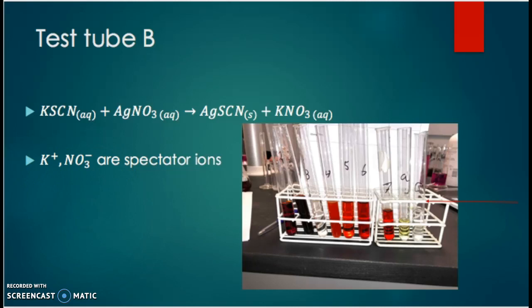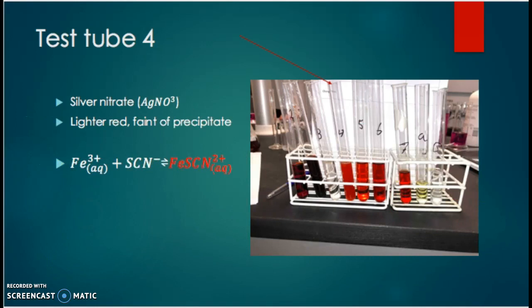In test tube four, we added silver nitrate and a decrease in the concentration of thiocyanate occurred. We observed the solution turned lighter red with a faint white precipitate. As in test tube three, the reaction went to the left.